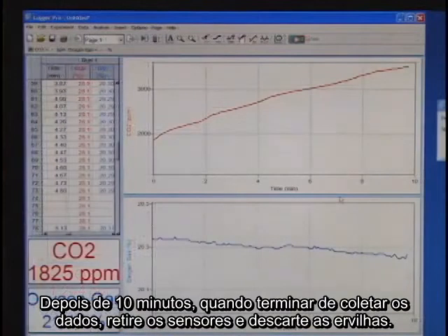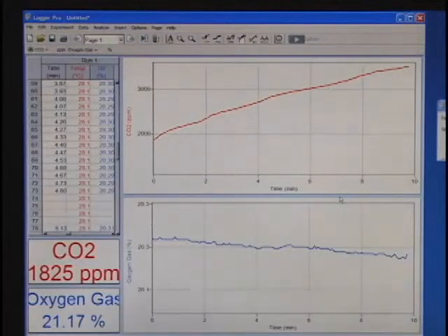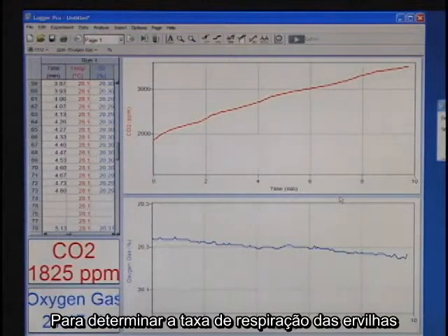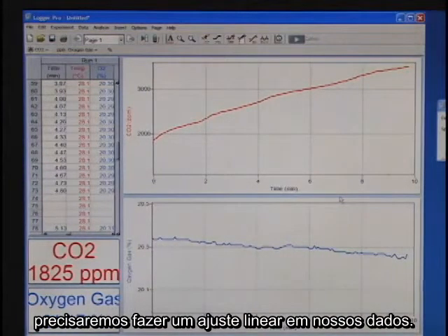When data collection is finished after 10 minutes, remove your sensors from the biochamber and pour out the peas. Flush out your bottle with water to remove any remaining CO2. To determine the rate of respiration for the peas, we'll need to fit a linear fit to our data.